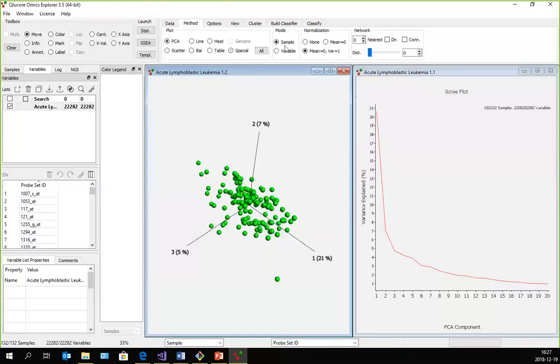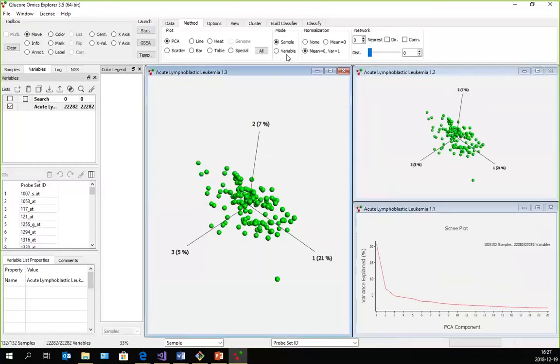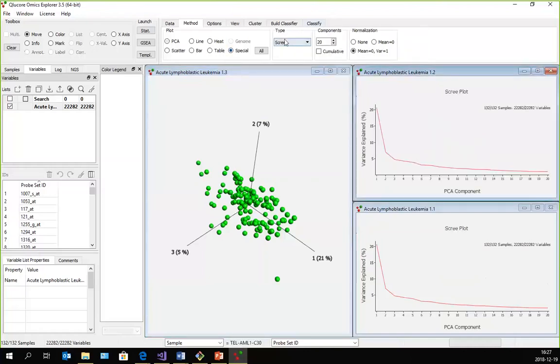And that's exactly what, if I bring up a third plot here, the talus plot is designed to solve, because the talus plot shows the logarithmized difference between each dimension rather than the dimensions themselves, which will give us a different view. And as you see, this is much more jagged because it amplifies the differences, which lets us see better detail in the higher dimensions.